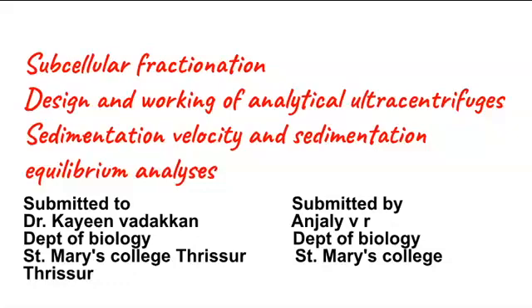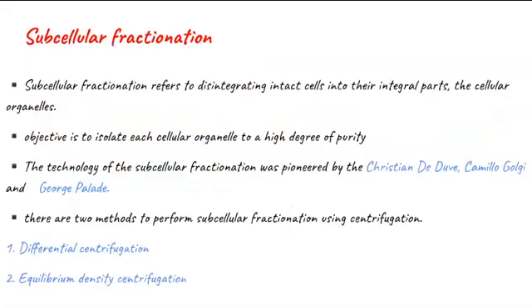Hello friends, my topic is subcellular fractionation, design and working of analytical ultracentrifuges, sedimentation velocity and sedimentation equilibrium analysis. Subcellular fractionation refers to disintegrating intact cells into their integral parts, the cellular organelles. Its objective is to isolate each cellular organelle to a high degree of purity.